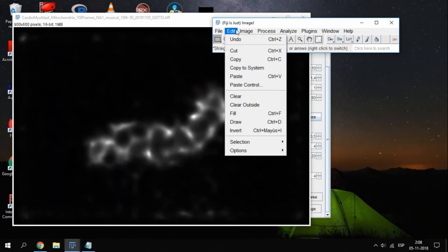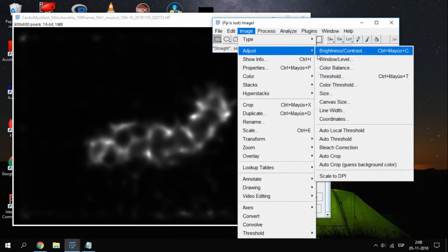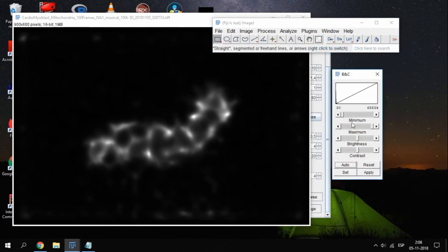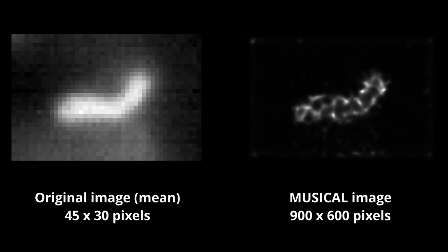You can now increase the contrast by using the histogram or by using another transformation, such as the log function. If we compare the original image, or the mean of it, since it's a stack, and the image obtained using musical, you can see how the details are sharper and the resolution is increased, allowing a better view of your data.